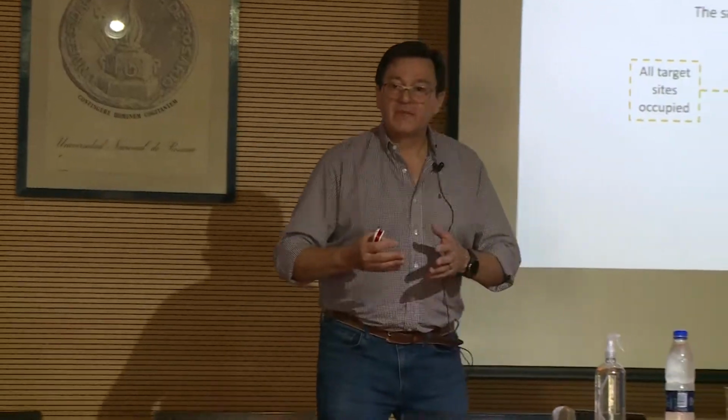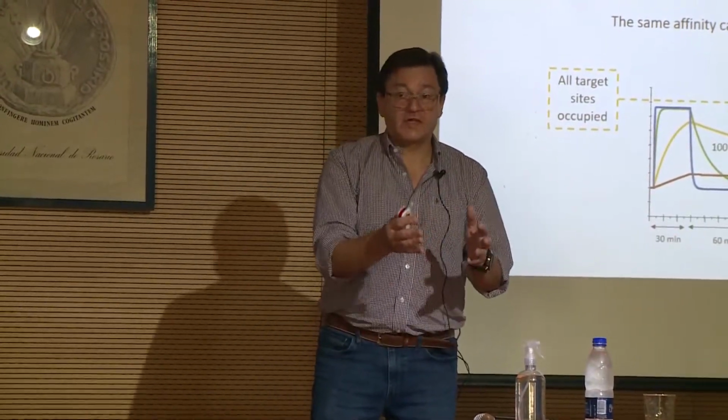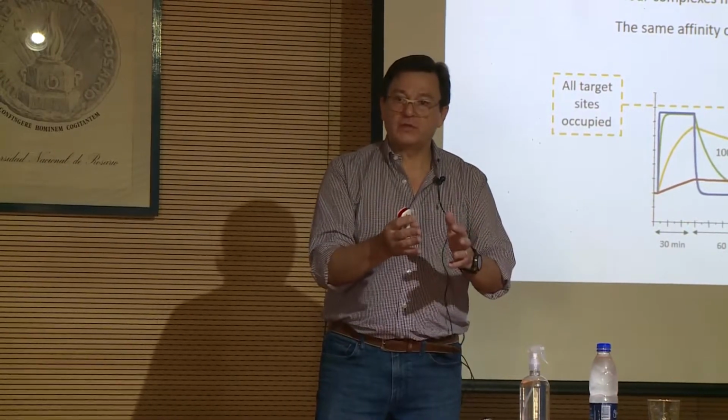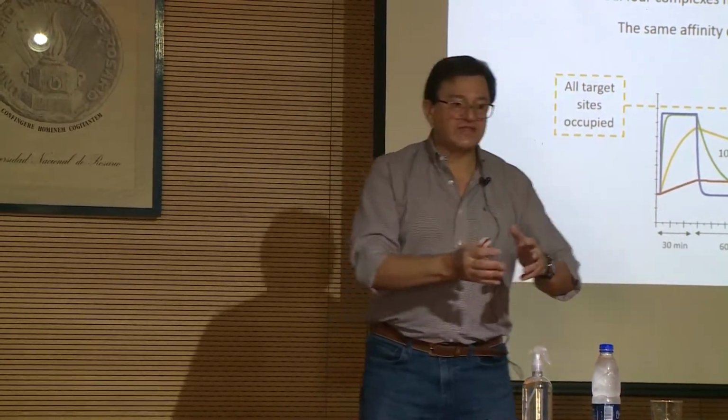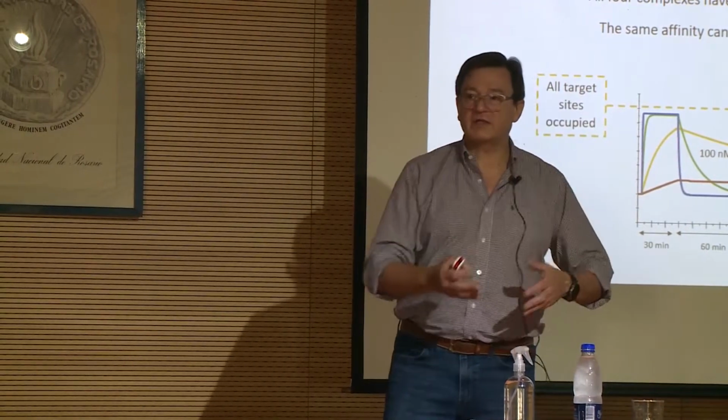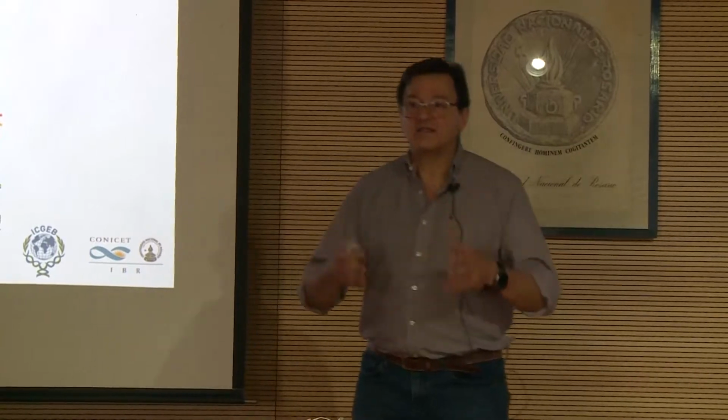If you are using a technology that is not in vivo, or is not probing the complex in solution, and you need to disrupt the complex, like filtering the complex or precipitating the complex, probably you won't catch your complex if it is a quick, speedy complex.